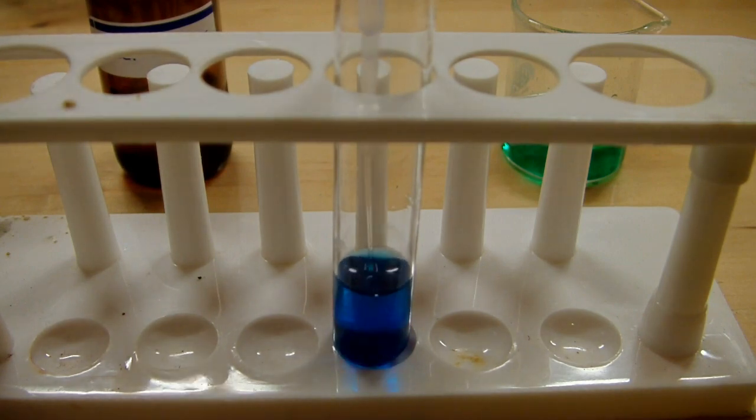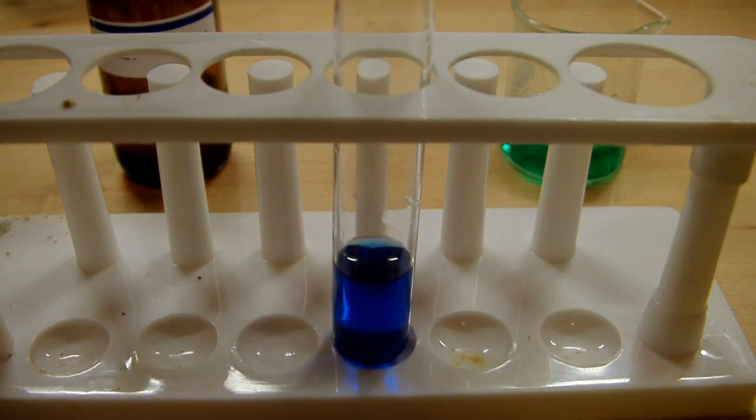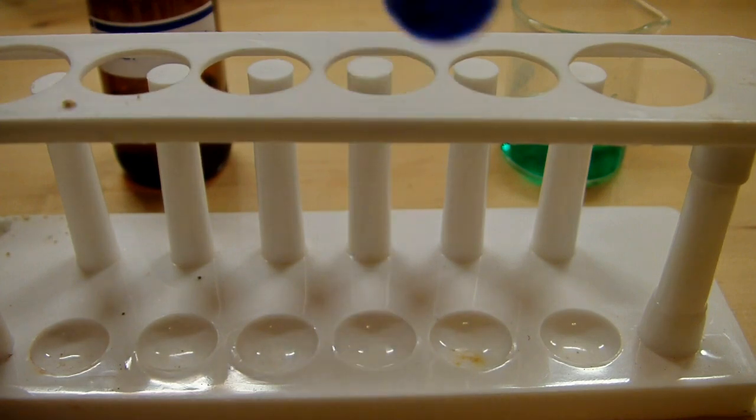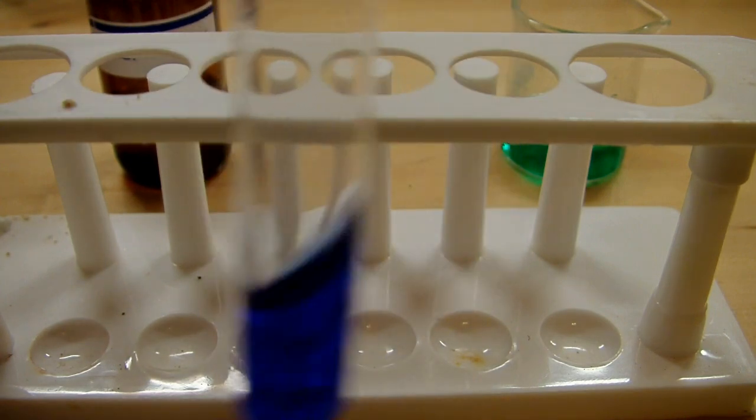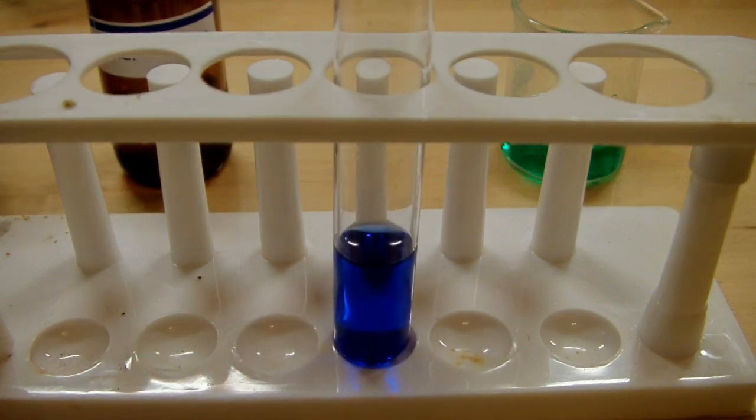So let's do a third milliliter, and why not, we'll do a fourth as well. Now you can really see the very deep blue coloration. This is from the ammonia complexing with the nickel chloride.